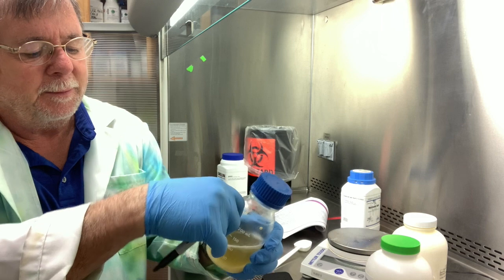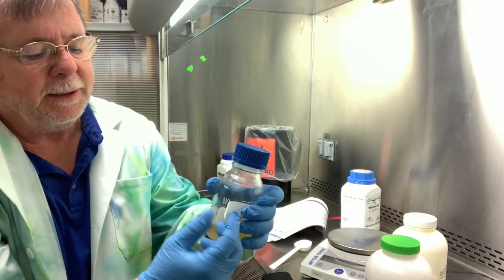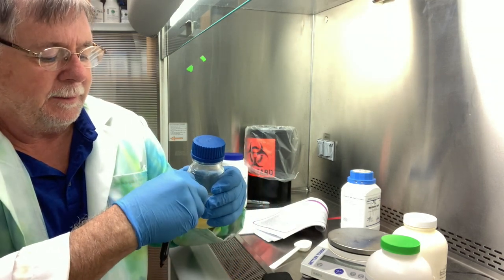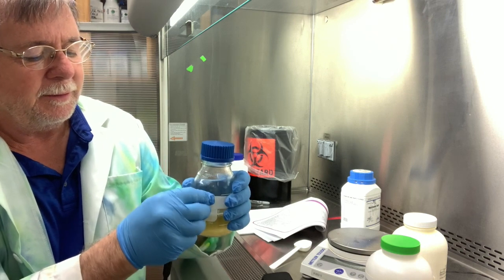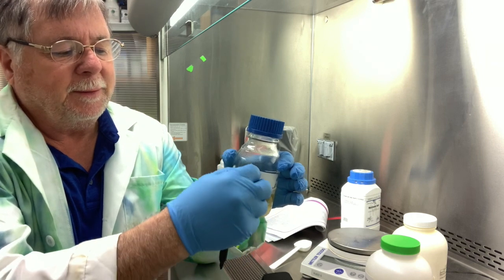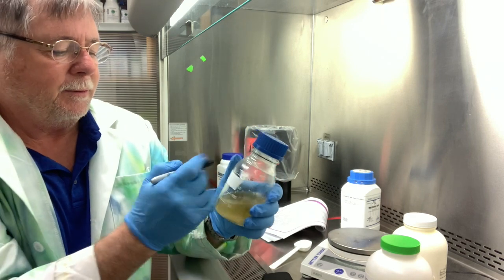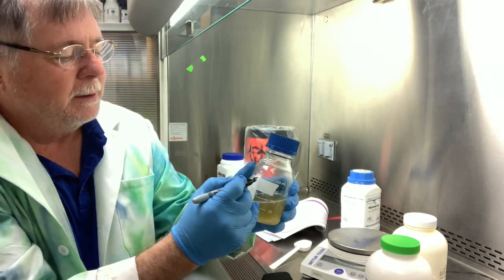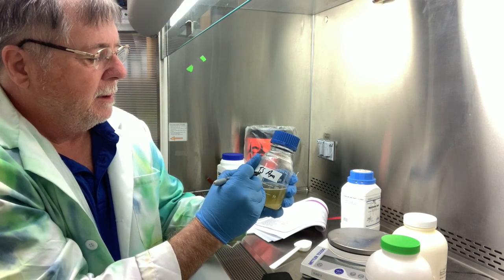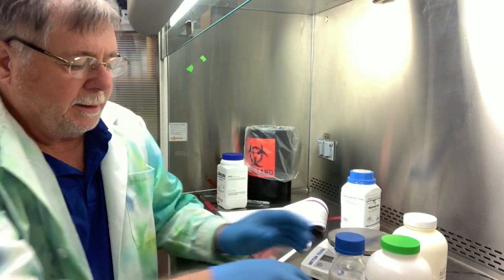Here's our label tape. We'll put it on. When you put tape on, help the lab people out a little bit by bending one edge of this under, so that it doesn't stick to the bottle as securely. So when they're ready to wash this, after you're done with your experiment, you're going to pull it off. Okay, so just do that little thing, and then we're going to call this one TS agar, and you should put your names or initials and then the date.